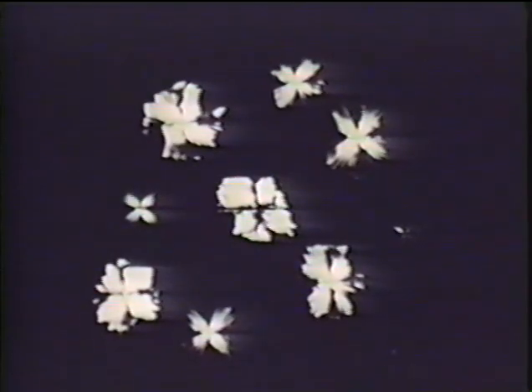As a simple biological example, these leaf scales are almost invisible. But under polarized light, their organized arrangement becomes visible.